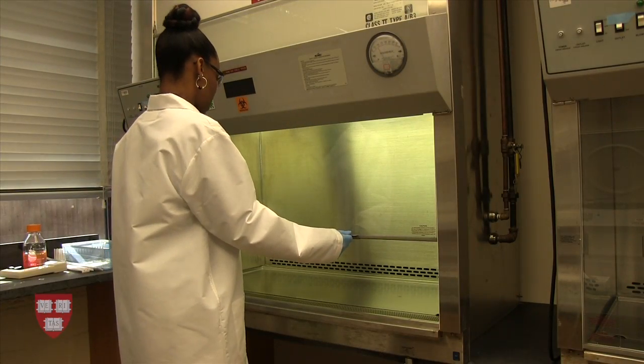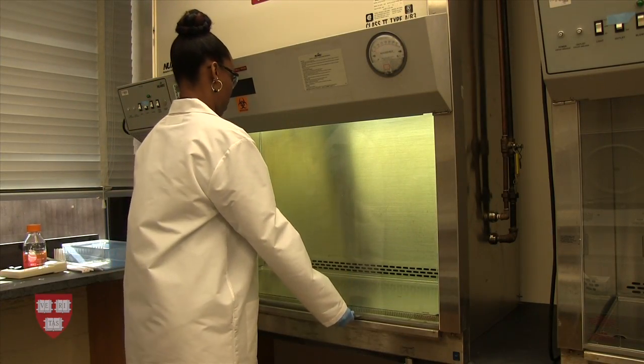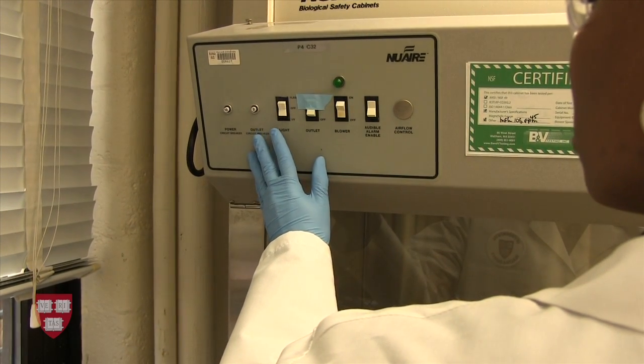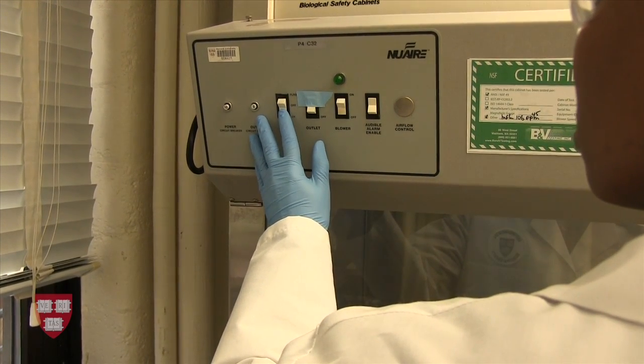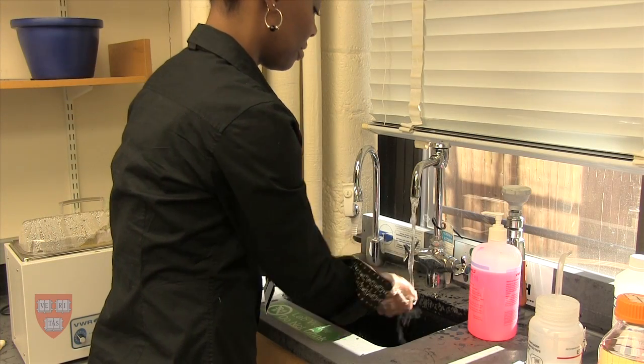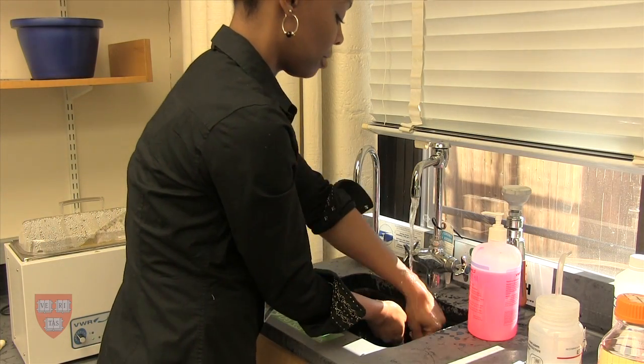For the BSC itself, shut the sash, turn the alarm and the blower off, and toggle the switch from visible light to UV light. The cabinet is now ready for the next researcher to use it. Finally, always remember to wash your hands after you have removed your gloves.